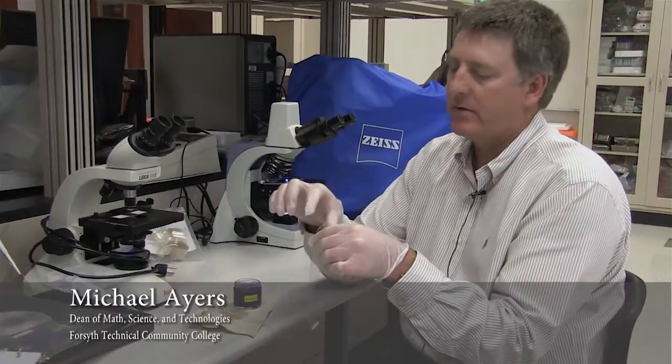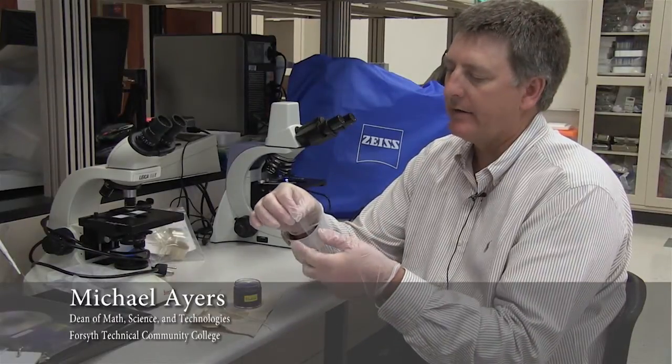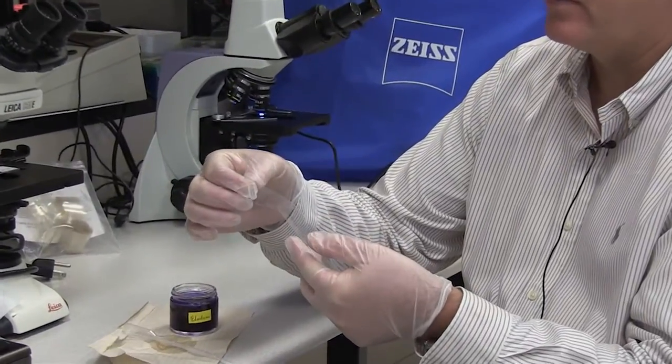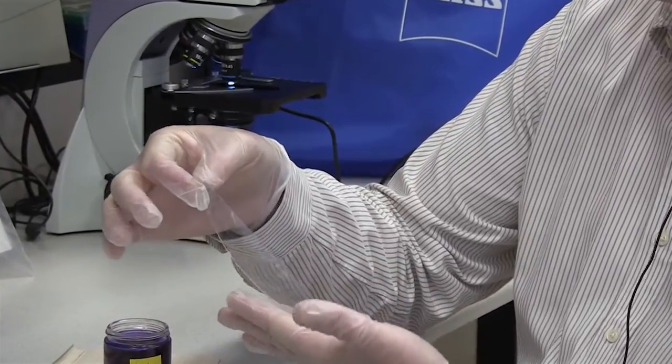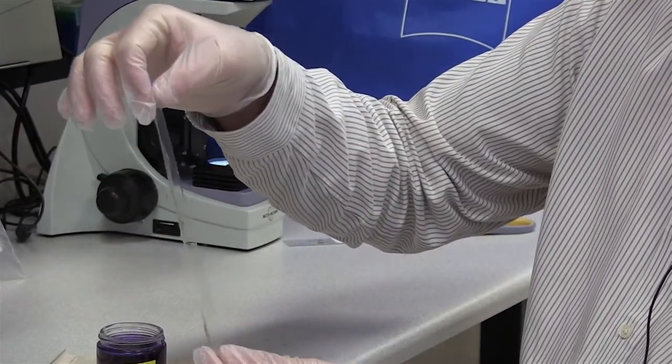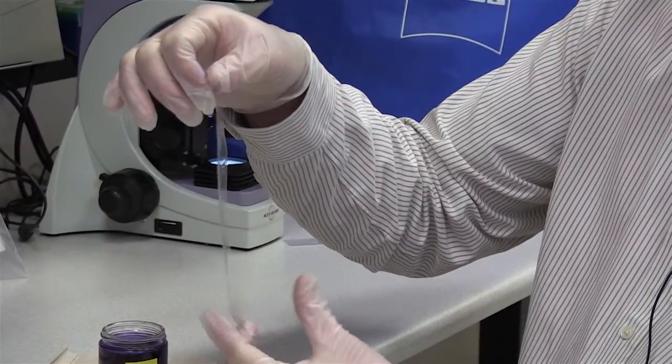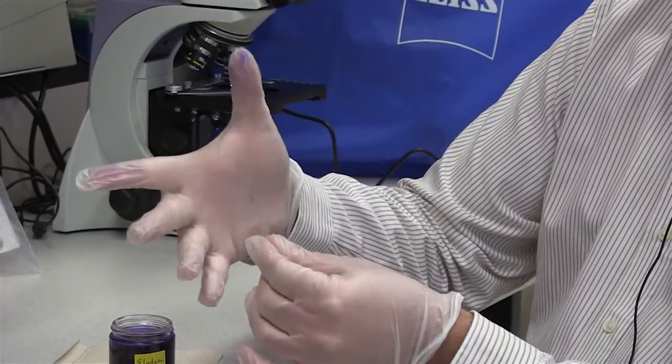Okay, so we want to demonstrate how to make a cell out of dialysis tubing. Now, it's not really a cell, but it's going to behave similarly to a cell, and so we'll just refer to it as a cell. And you can see we have a piece of dialysis tubing, and it's open on both ends. Now, it's safe to handle.